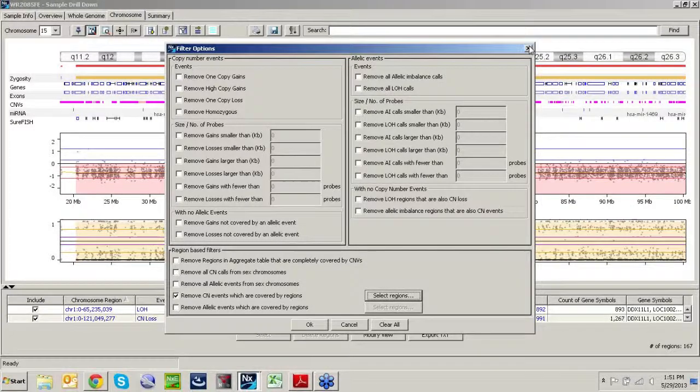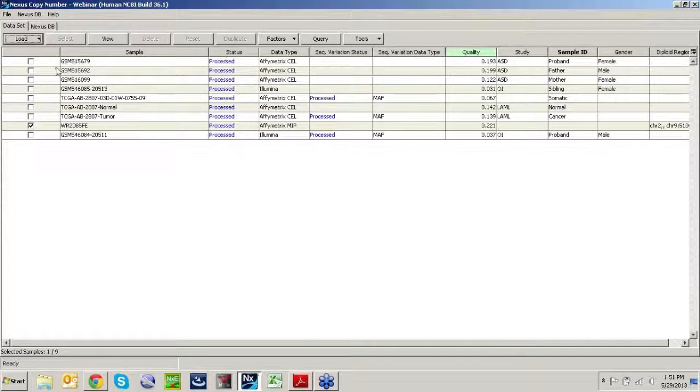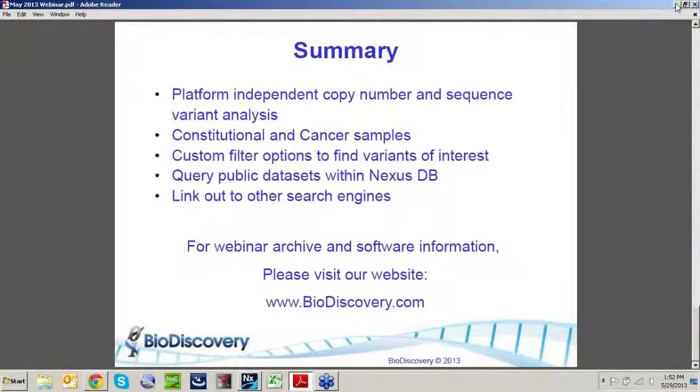Great, thank you. There are a number of questions about Nexus DB here, so perhaps it might be good if you could go over the concept of a project in the desktop application, as well as what is exactly Nexus DB. For example, how is the data uploaded, when it's deleted, who's responsible for the keywords in Nexus DB, etc.